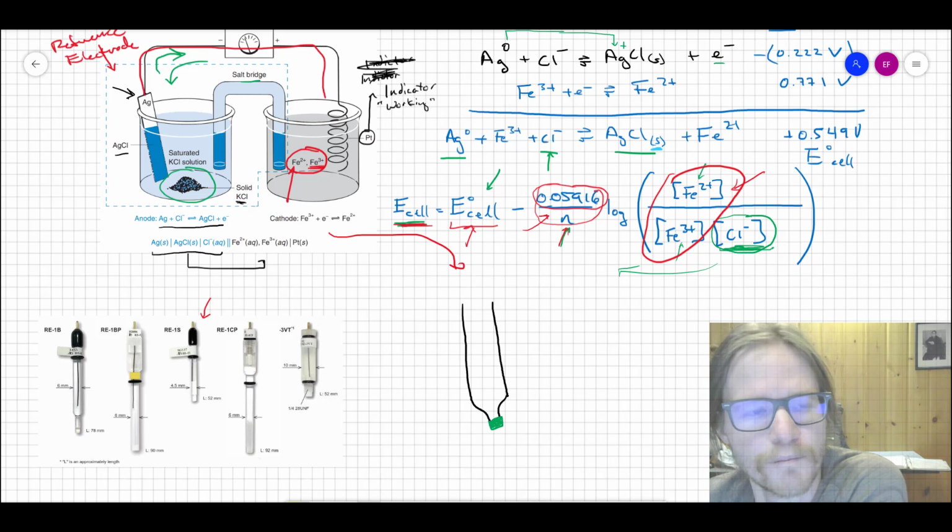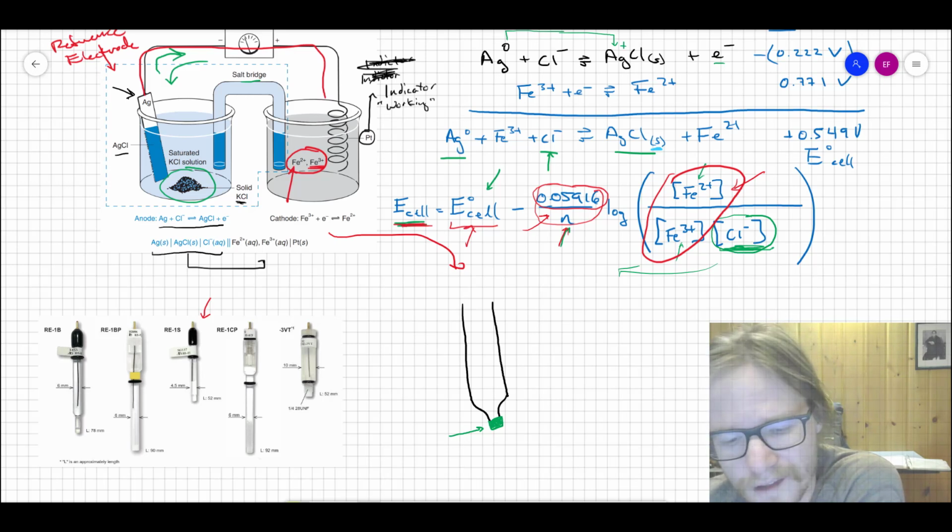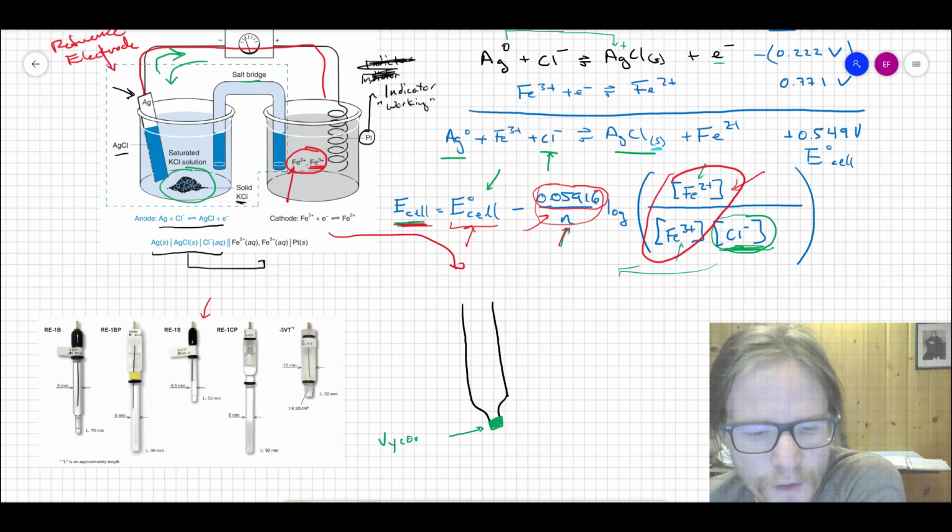Instead of having this big, cumbersome, bulky salt bridge tube, we've shrunken that down to this tiny little thing. I don't know what the equivalent size is, but roughly 5 by 5 millimeters. Tiny piece of porous glass. They call this stuff Vycor. It's got its own really interesting story that relates to World War II that you can ask me about if you're interested. They don't make this stuff anymore, so all the electrochemists in the world bought it up, I being one of them. So I've got a whole package of Vycor for this very reason, and we've got a bunch of them to make ourselves.